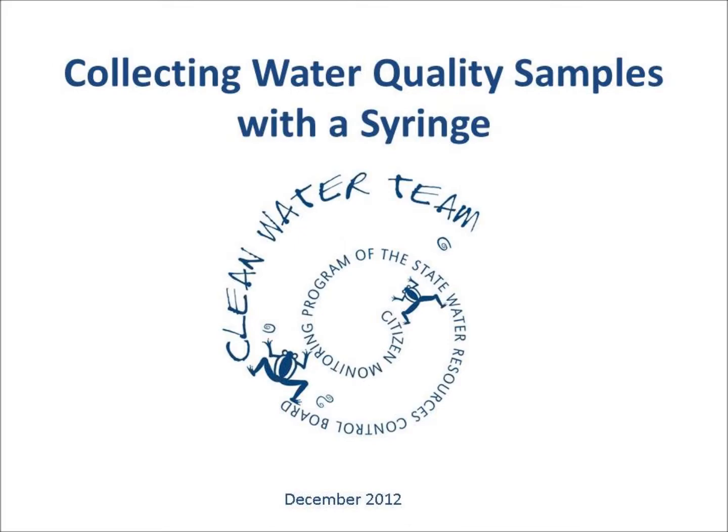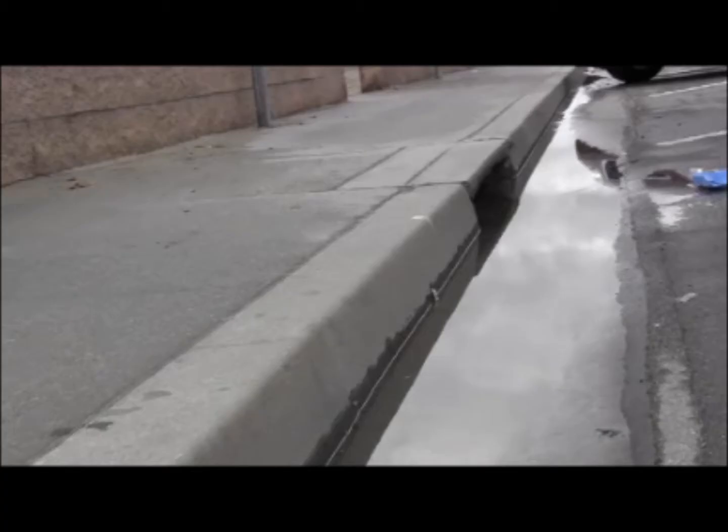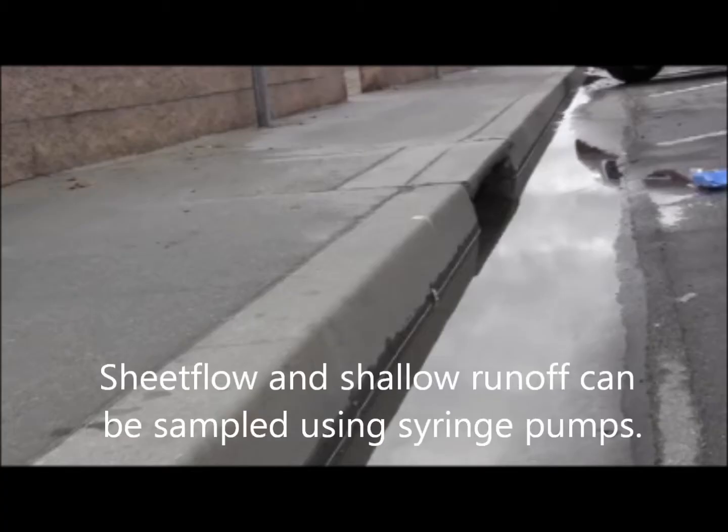Collecting water quality samples of sheet flow and very shallow runoff in stormwater can be extremely difficult. This task can be accomplished though with the use of syringe pumps.